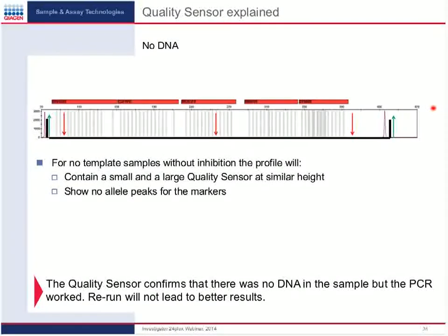In case you're doing casework samples, you don't have to repeat your experiments because it will not lead to better results. Or another option would be to increase the volume of your template DNA to get maybe any small peaks above the threshold.